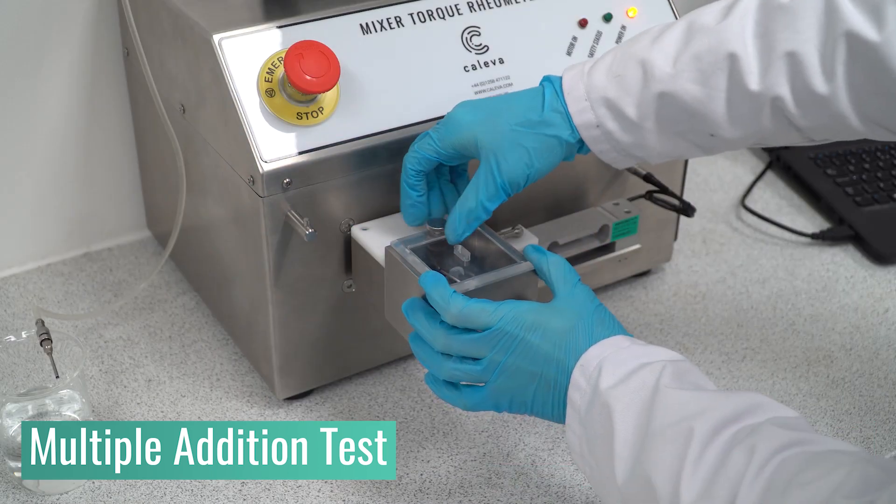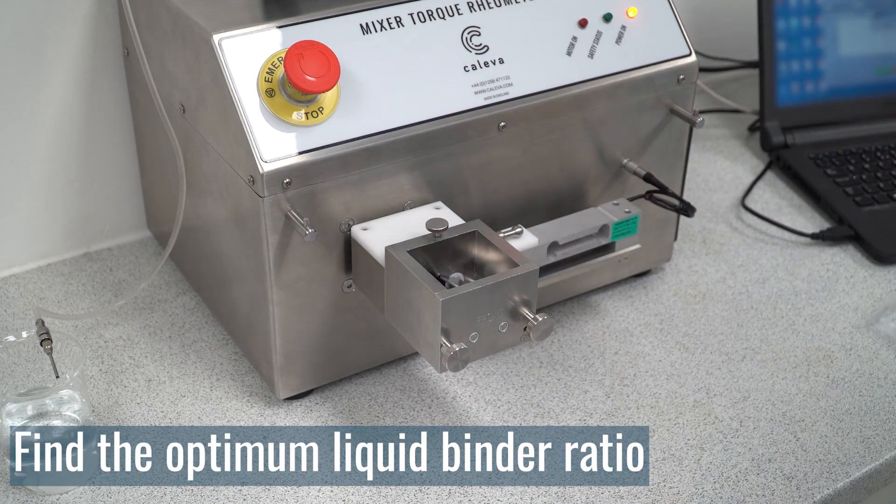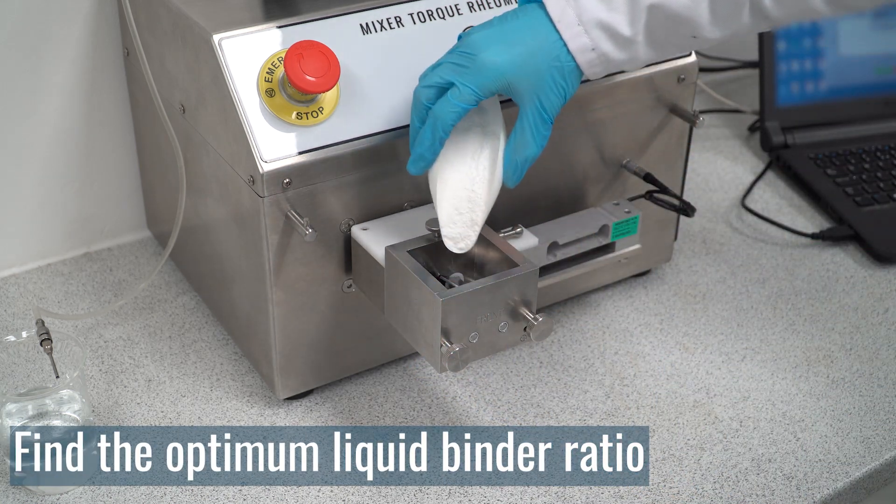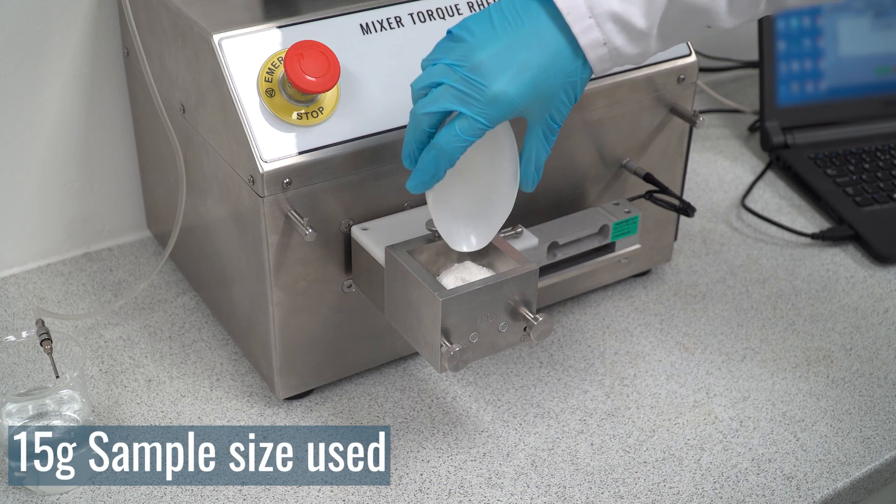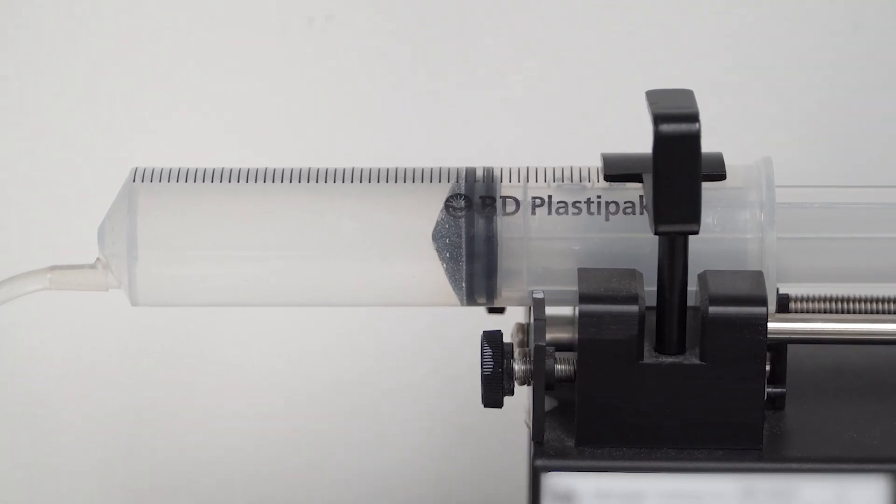Firstly, the multiple addition test will determine how much liquid binder your specific formulation needs for your desired result. In this experiment, a small sample of 15 to 40 grams of material is added to the mixer bowl and the automatic syringe pump is primed with liquid binder.